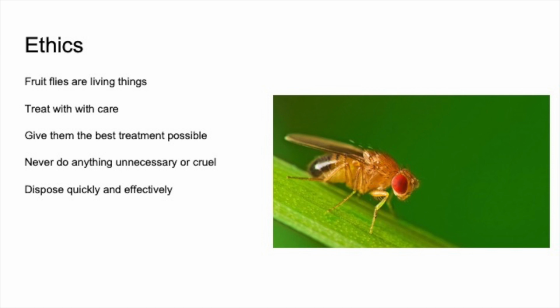So you want to keep your flies as healthy as possible and treat them as well as possible. And really, the healthier you keep your flies, the better the data will be. The healthier you keep your flies, the easier it will be to phenotype them, the more quickly they'll go through generations, so you'll be able to do science either more quickly or get more done. They'll be more consistent and more predictable, whereas unhealthy flies will take longer to pupate, or longer to develop, or longer to lay eggs, which will throw off your whole schedule and be a huge pain. So the better you treat your flies, the better science you'll get out of it.